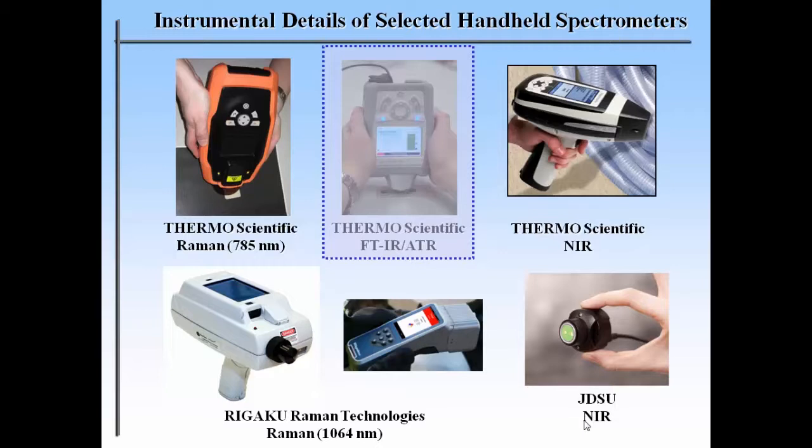Monopoly means this. So shrinkage in size is not shrinkage in price, unfortunately. The instruments are still quite expensive. What I've shown you is the 3 instruments on the table with a laptop behind, where I said a micro vibrational spectroscopy laboratory you can put on a table. It will cost you something like $150,000. The 3 instruments, $50,000 roughly. So one of these instruments here will cost you $50,000. It's almost the same price like a benchtop instrument. That's a problem.